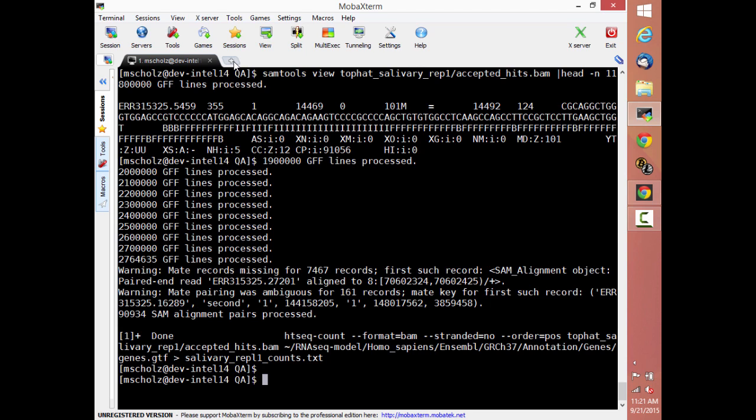I'm not going to tell you not to use multiple tools. I'm going to tell you that as soon as you use more than one tool or more than one pipeline, you're opening yourself up to a world of confusion, and you need to plan in advance what you're going to do with it. You can combine the results. You can do any of those options that I just mentioned. I just don't know which one's right. And I'm not sure that anyone will.